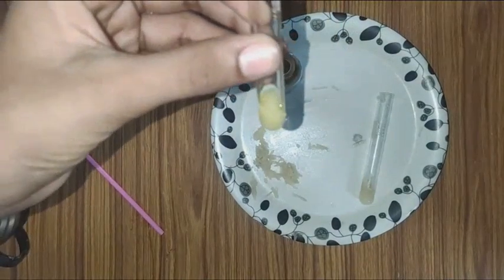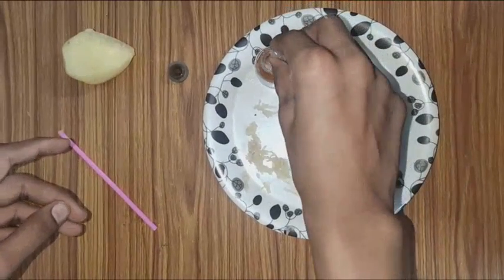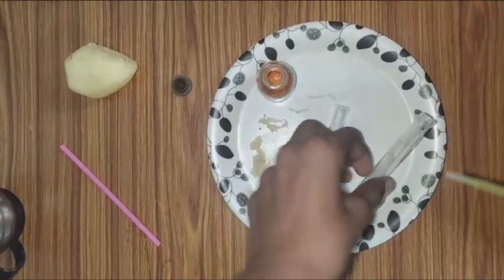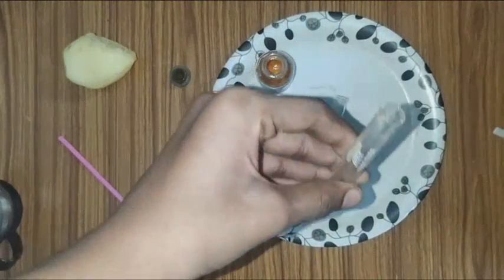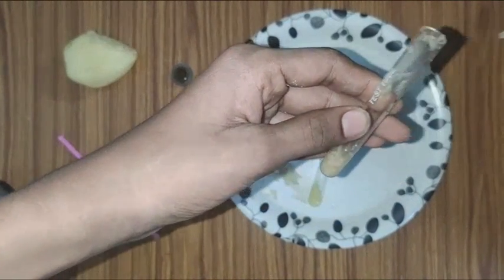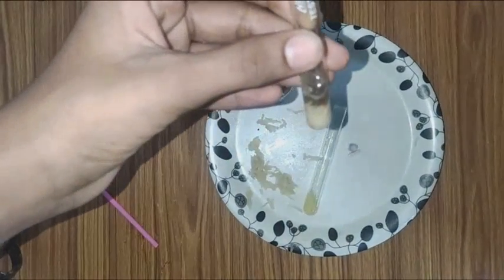Now, we have to do the same step with test tube one. First, we have to take a few drops of iodine with the help of the dropper and pour it inside test tube one which contains grated potato. I have completed.